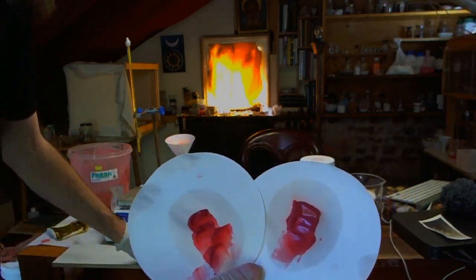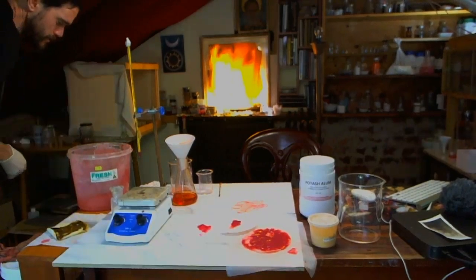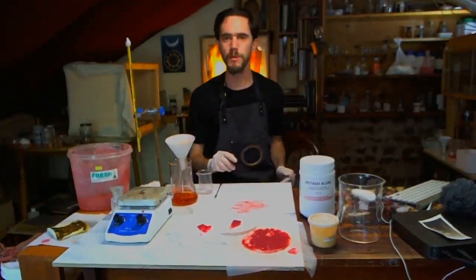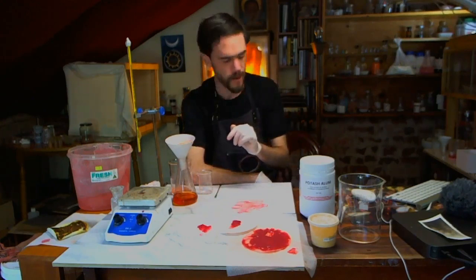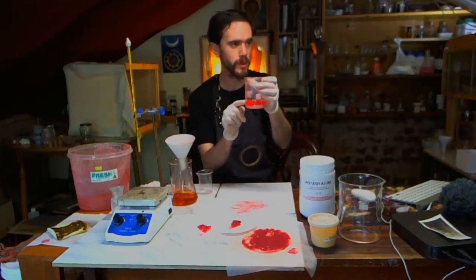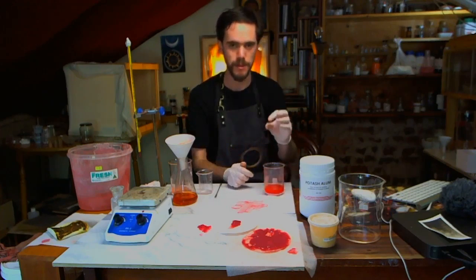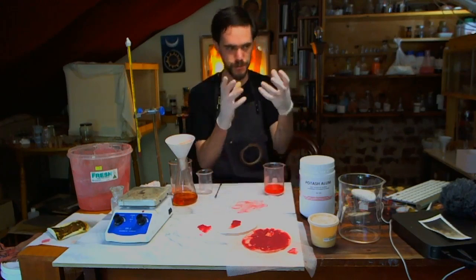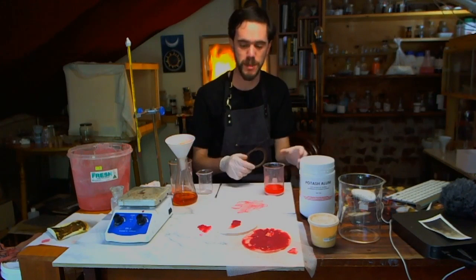I guess the trick will be figuring out how to separate the red liquid from the lead sulfate before the pigment wants to solidify and become solid. That's what I'm trying to say here.